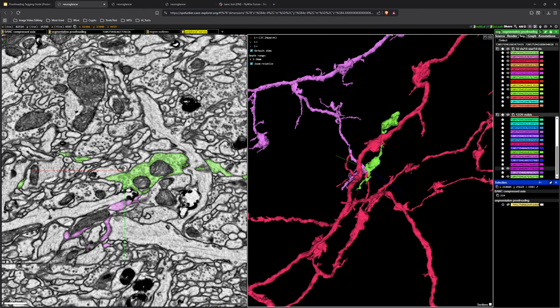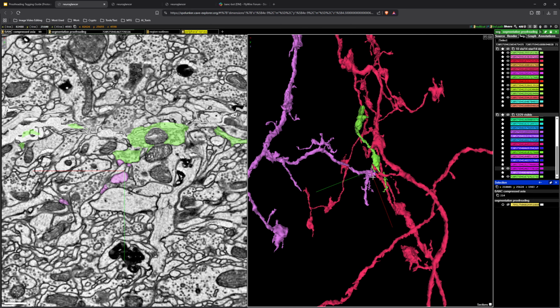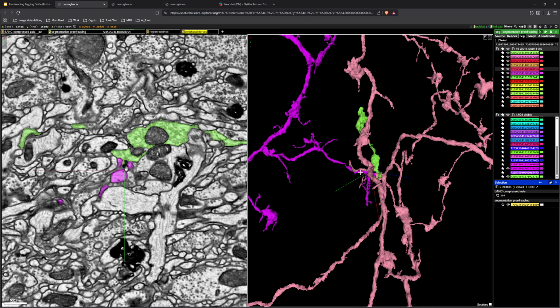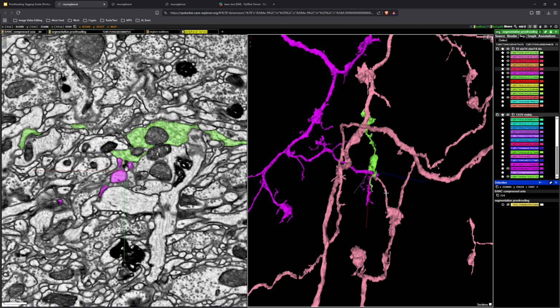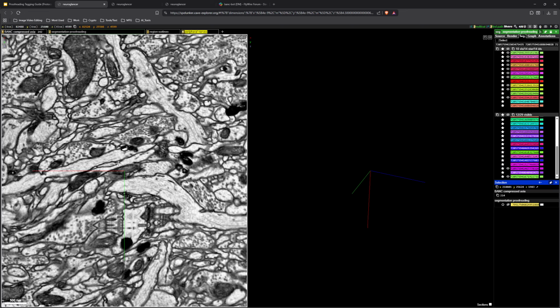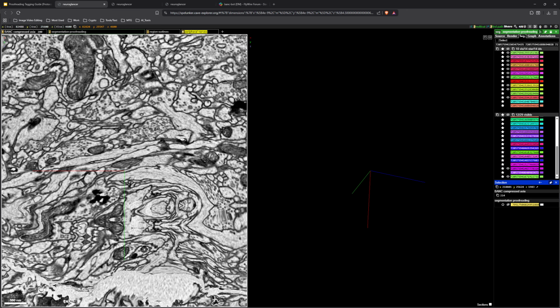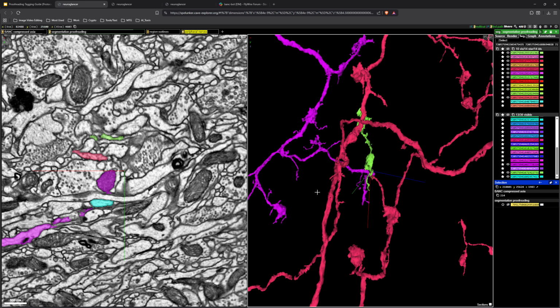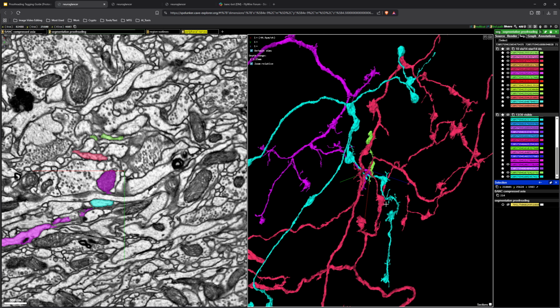And because we traced this from here to here and there was no obvious place where it broke, one thing we can do to help increase the confidence of this branch is to backtrace. Instead of from here to there, we go from here to wherever that goes. Since we now believe it doesn't go here, we can eliminate that as an option and use the same sort of strategy. So we get a thinner, flatter piece here, squished between these two longer ones. Here's the two longer ones. There's the thin, flat one. Then we can double click that. As you can see, that leads to this branch.